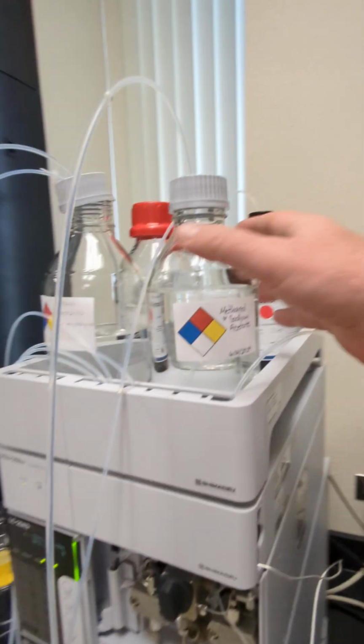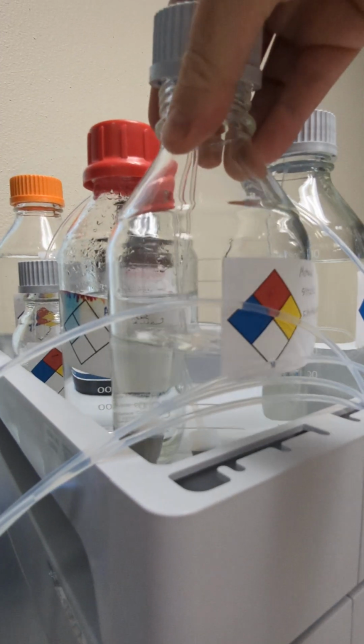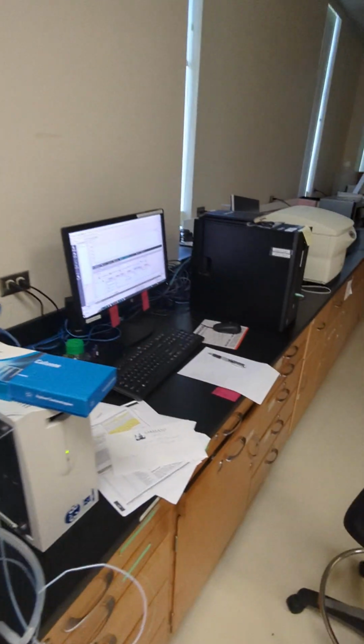The reason we want the pump off is that right now we don't have a lot of this reagent yet. Our methanol is about halfway only, so we're going to want to fill that up at some point again when it gets a little lower, to about 100 mils.